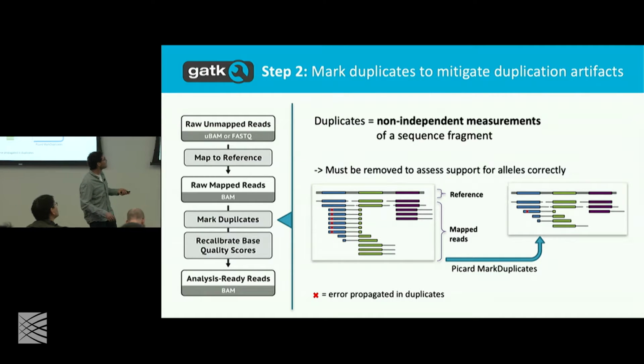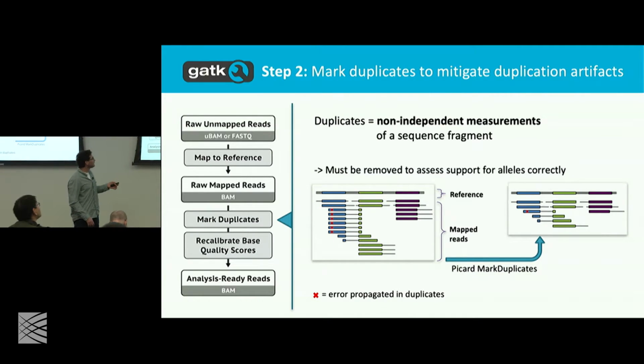It's a very original name. And the important thing to know about the way MarkDuplicates works is that it does not at all look at the bases. Okay? It does not look at the bases. It looks at the alignments only. So the idea is that bases could be slightly different due to sequencing errors. We're not going to take a 150 base pair read compared to another 150 base pair read and declare them to be duplicates or not duplicates based on the specific bases that are in them. Because there could be a sequencing error.